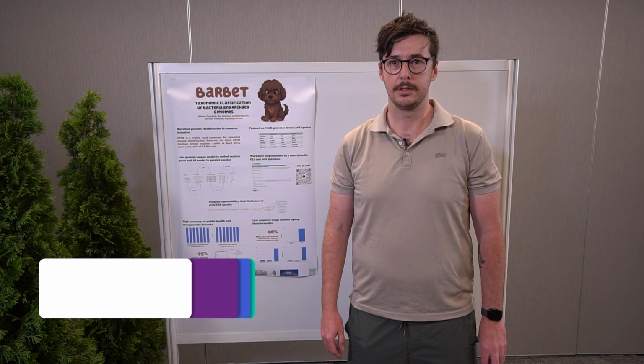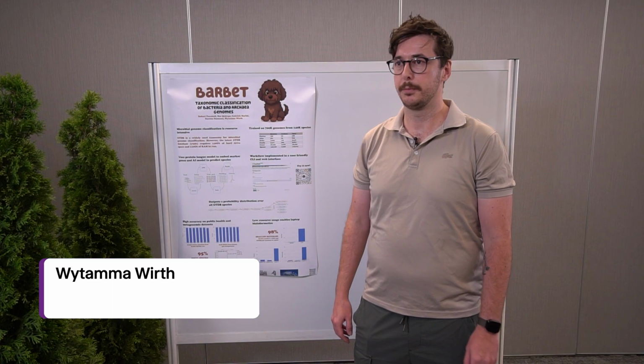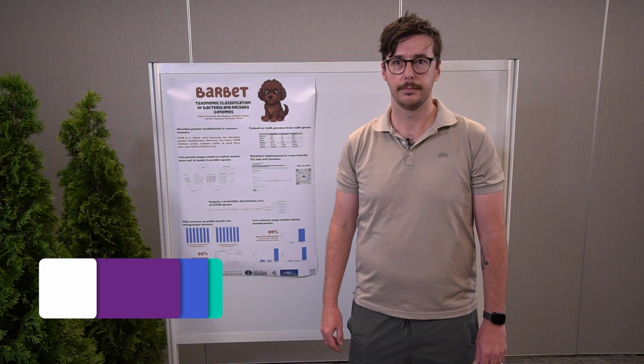Wirth from the Peter Doherty Institute in Australia. I'm going to talk about our tool Barbet that we developed for bacterial taxonomic classification.